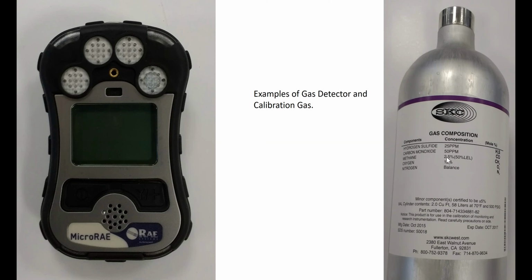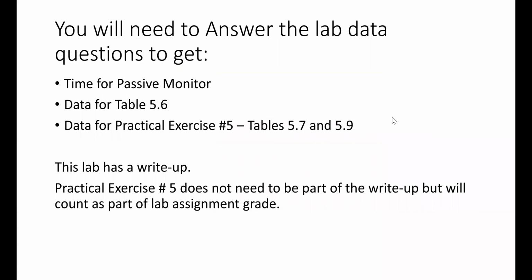So I can say that my instrument's accurate as long as it's reading between 0 and this reading, because I know that's linear. When it goes beyond that, the sensor may give me a reading, but I'm less certain about the accuracy of that reading.